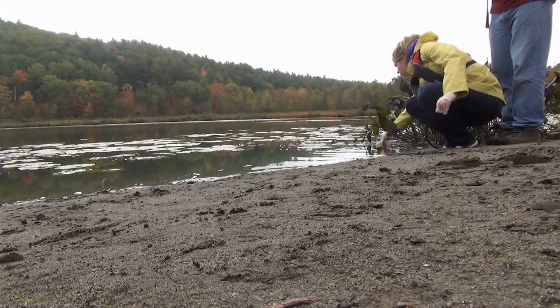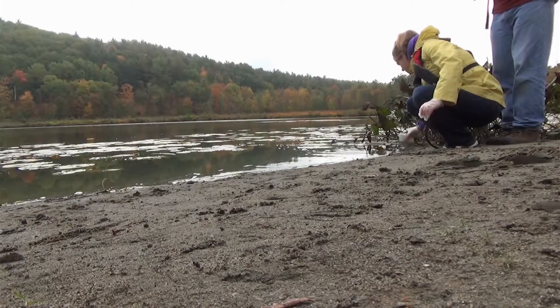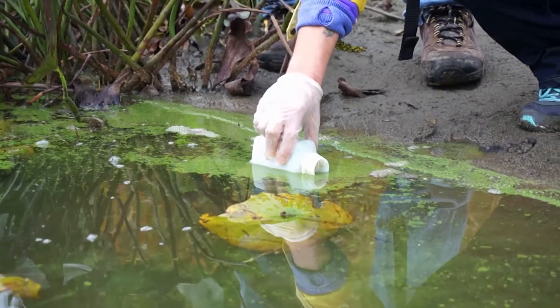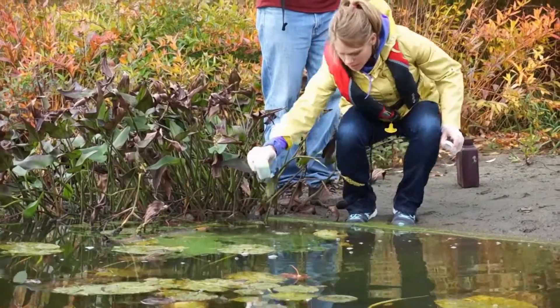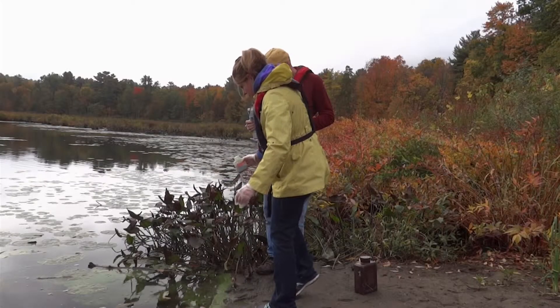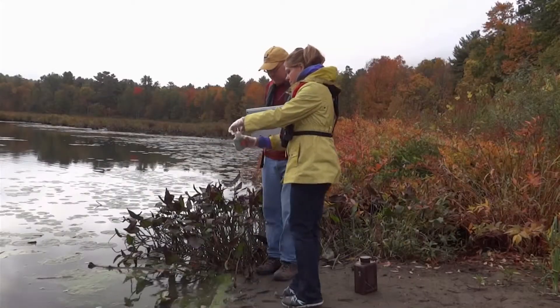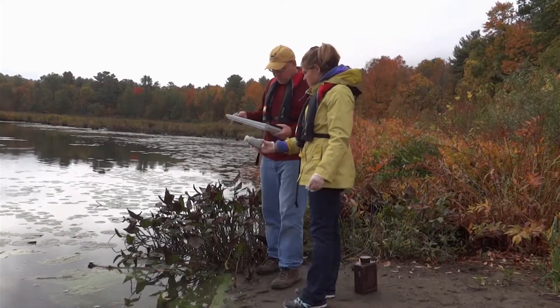You'll fill up as much of the bottle as you can. If possible, fill it up to the shoulder. If you need to drop the bottle a little deeper into the water to get a little bit more water, you can do that too. Then you'll place the cap on it, and we'll fill out the paperwork.